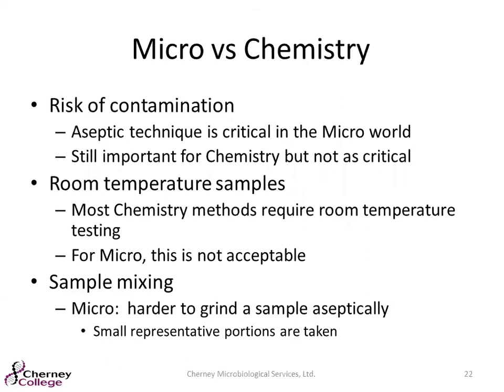So, risk of contamination. As we have talked about, aseptic technique is super critical in micro; it can greatly change your result. It's important for chemistry, but it's not as critical. A staph count probably isn't going to change your protein result, for example.